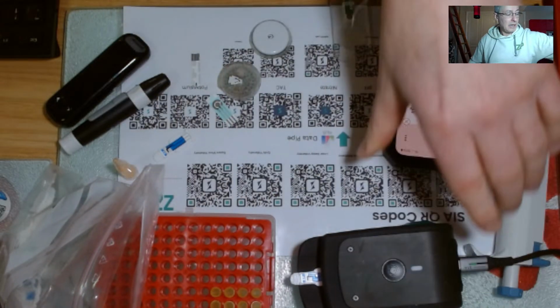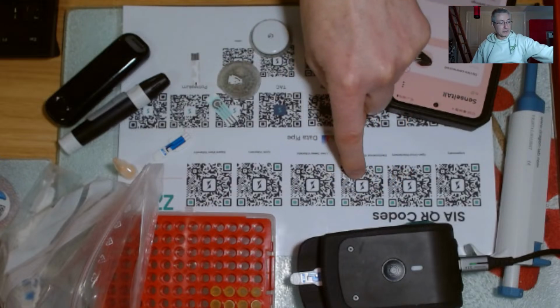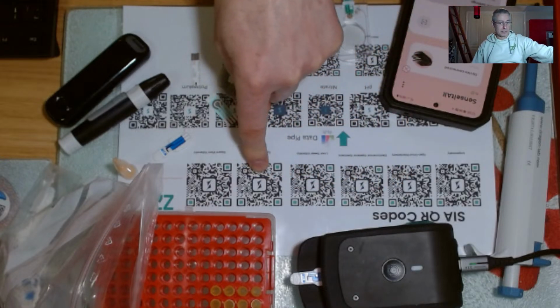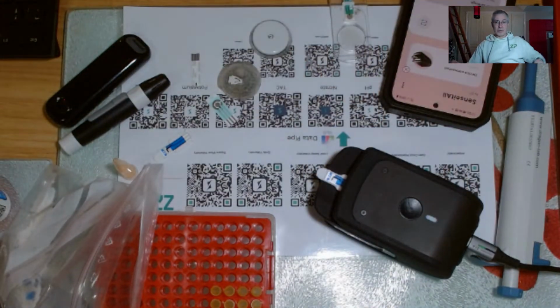It does amperometry, open circuit potentiometry, impedance spectroscopy, linear sweep voltammetry, cyclic voltammetry, and square wave voltammetry. So it's quite nice because we can follow the functionalization of these screen printed electrodes using cyclic voltammetry, and then we can read the assay using square wave voltammetry.